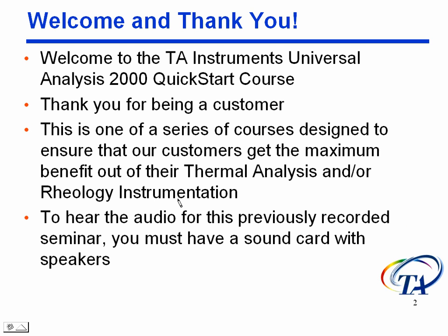The first thing I'd like to do is thank you for being a customer. The fact that you're here at all now means that you've already purchased an instrument, and we appreciate that. In connection with that, we've designed a series of courses aimed at ensuring that our customers get maximum benefit out of their thermal analysis and rheology instrumentation. These QuickStart courses in particular are intended to be taken as soon as you get your instrument installed with your service representative, and probably before the technical representative even comes in to give you some hands-on training. It's intended to basically get you up and running with the program.